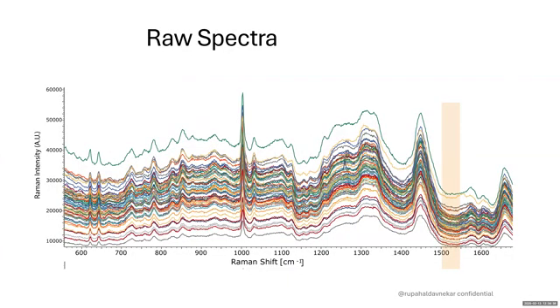Looking at the complexity, and because this is label free, we need to apply analytics on it, which should be advanced analytics. So we use unsupervised multivariate analysis, like principal component analysis. Principal component analysis is typically exploratory analysis, and we try to get much information from it, such as which peaks are responsible for giving us some information. We pay a lot of attention to principal component loadings and principal component scores. That way we can filter out the significant peaks. And once we extract those peaks or features, then we can apply supervised machine learning. I typically use artificial neural network and partial least square discriminant analysis to analyze this type of data sets.